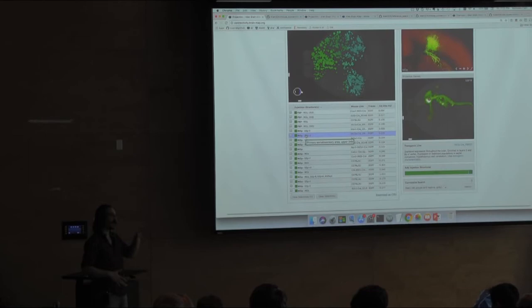And then something like level sets of activity are computed in the two cases, because as you sweep across retinotopy, you're basically sweeping a wave across retinotopy or across the cortex in one way and then the other way. And then you compute the cosine between the level set vectors of those things, and that determines whether it's blue or red. That's all I know.